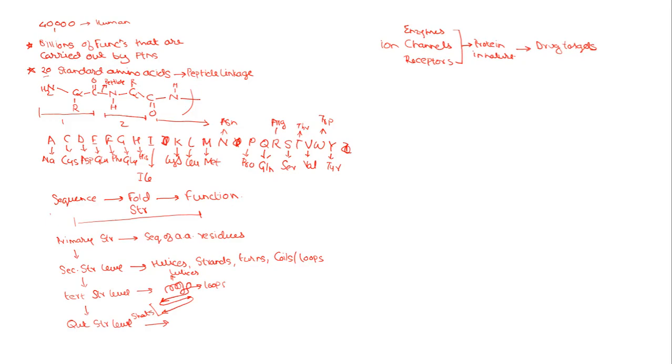Okay, so in most of our practical or demonstration sessions, I would be using the software called SPDBV. It is also sometimes called Deep View. SPDBV stands for Swiss PDB Viewer, or it is sometimes referred to as Deep View. Now there are other options available.